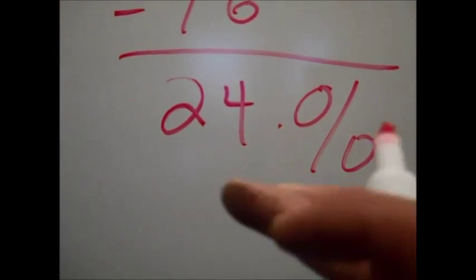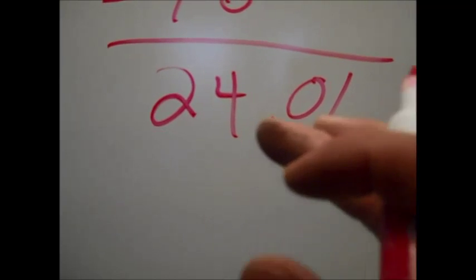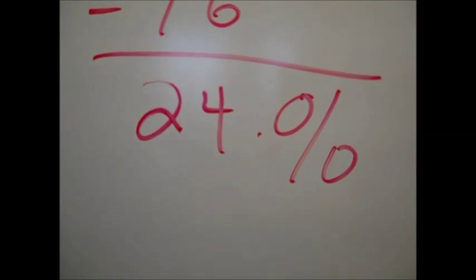So whatever measurement you use, you can calculate the percentage off of that. A sandy soil will have a higher percentage of pore space, and a clayey soil will have a lower percentage of pore space. Silt will fall somewhere in the middle. Remember to dry your soil, and remember to repeat this 3 times for your different soils.